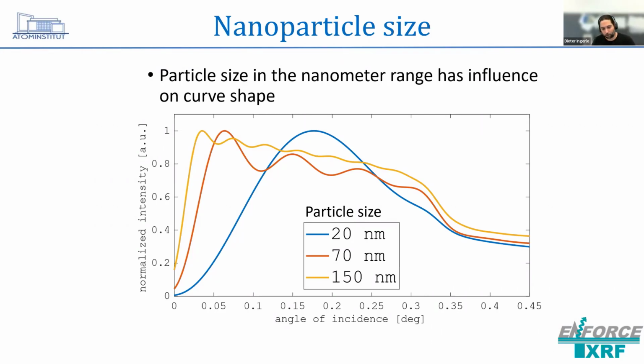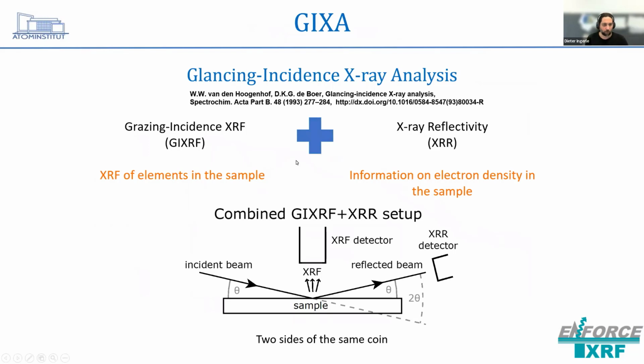Actually, we are using, as we'll discuss maybe later, also this effect to try to determine the size, of course, of nanoparticles, but it can also be an unwanted effect. So yeah, basically now to come back also to the combined analysis, which is sort of the topic here.